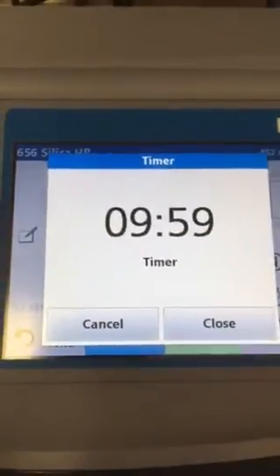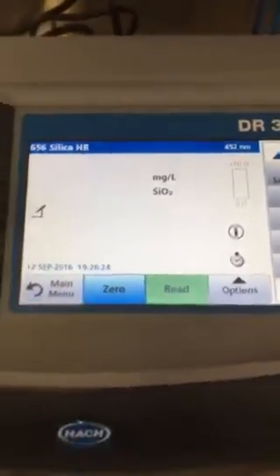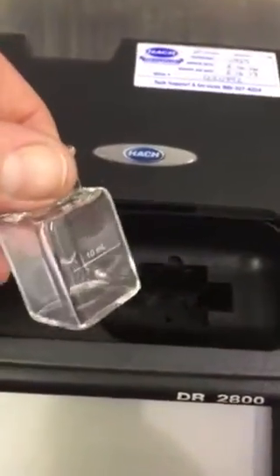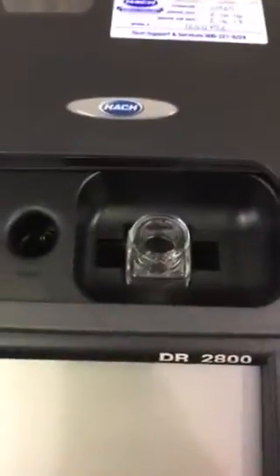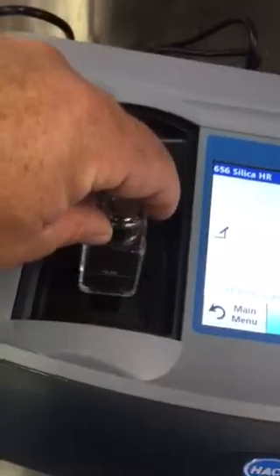The biggest difference between the DR 3900 and the DR 2800 is the sample cell orientation. On the 2800, we would line up the 10 mL line and turn it to the right when placing it in the sample holder. On the 3900, instead of turning to the right, you're going to face it towards you when you put it in the sample cell.